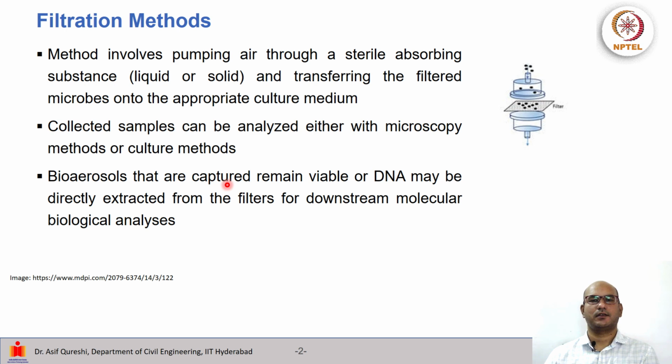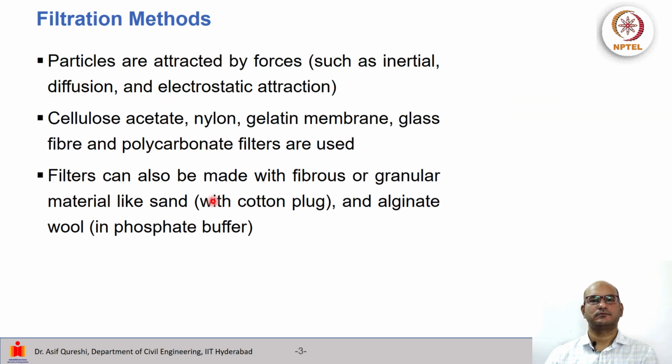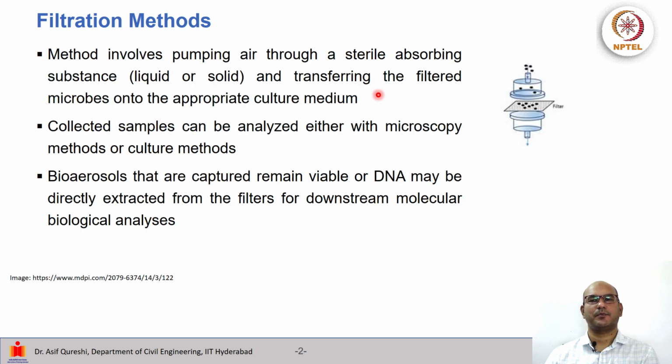Bioaerosols that are captured generally tend to remain viable, or the DNA may be directly extracted from filters for downstream molecular biological analysis. The particles are generally attracted by forces. This could be inertial, diffusion, and electrostatic. Mostly our filters will have a pump attached at this end. The pump will draw out air. So it's kind of like an air suction force being applied, and the particle passes through the media.